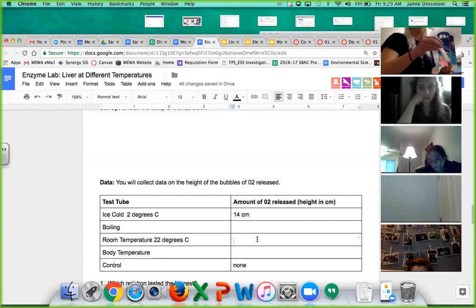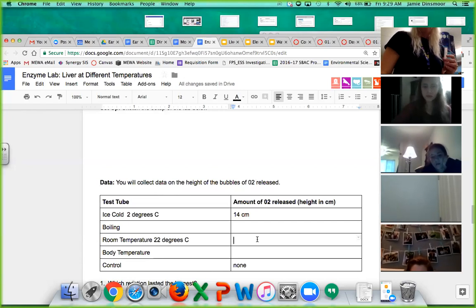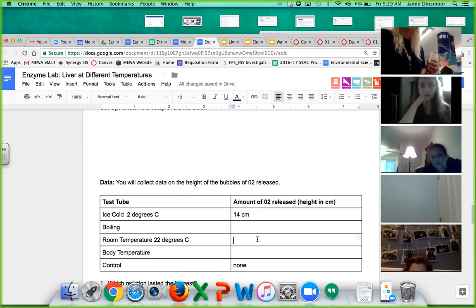All right, room temperature. You guys think it's going to be more or less than the freezing cold? Go ahead and type in the chat more or less. Destiny says less. Colton also says less. We got some mores, lesses. Okay. This will be interesting to find out. Now keep in mind too, right? This might not be at exactly room temperature, but it's pretty close.